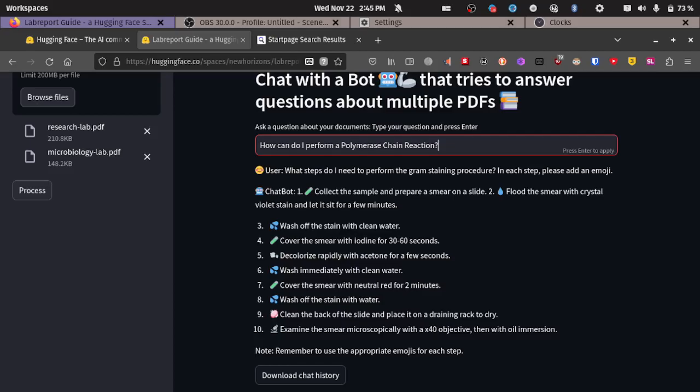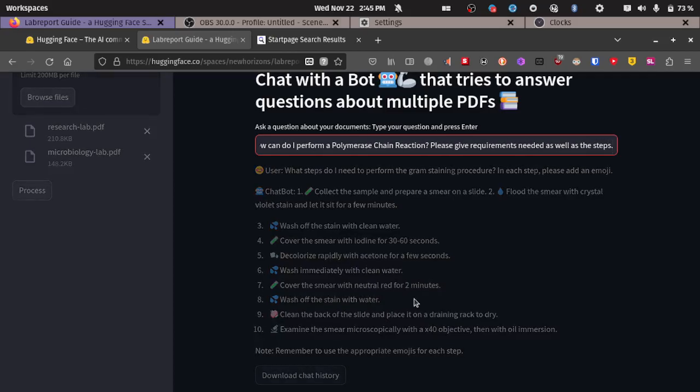As I try to remember what that is, let's just ask this question. So let's just search that.